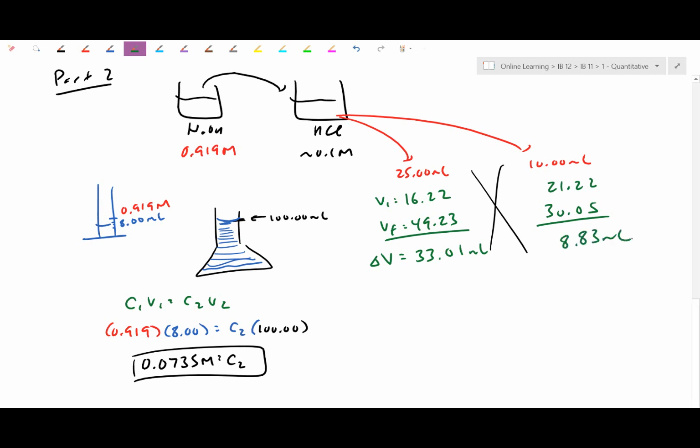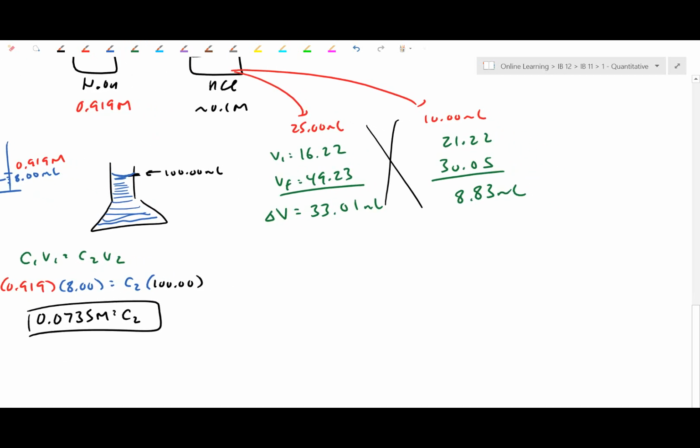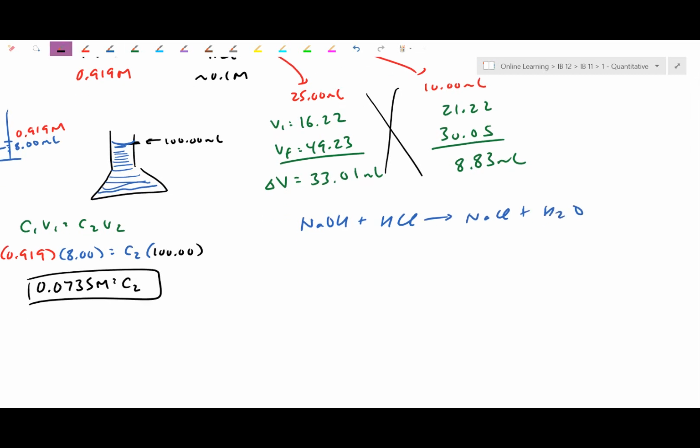Usually you'd average these two, but this time they're totally different size aliquots, so we're just left with doing the calculation twice. This time here, not as hard to see. NaOH here is going to react in a 1-to-1 ratio with our HCl. I'm going to just go straight to our calculations. We're interested in finding the unknown HCl. Let's do it from the data in trial 1.